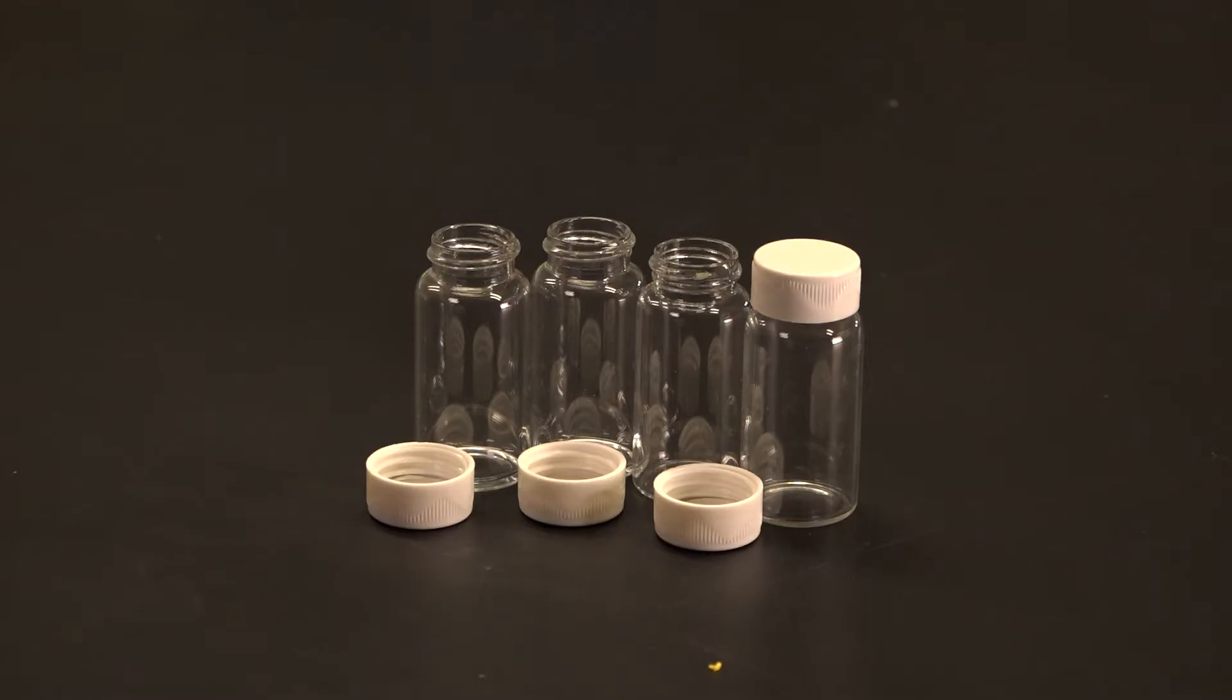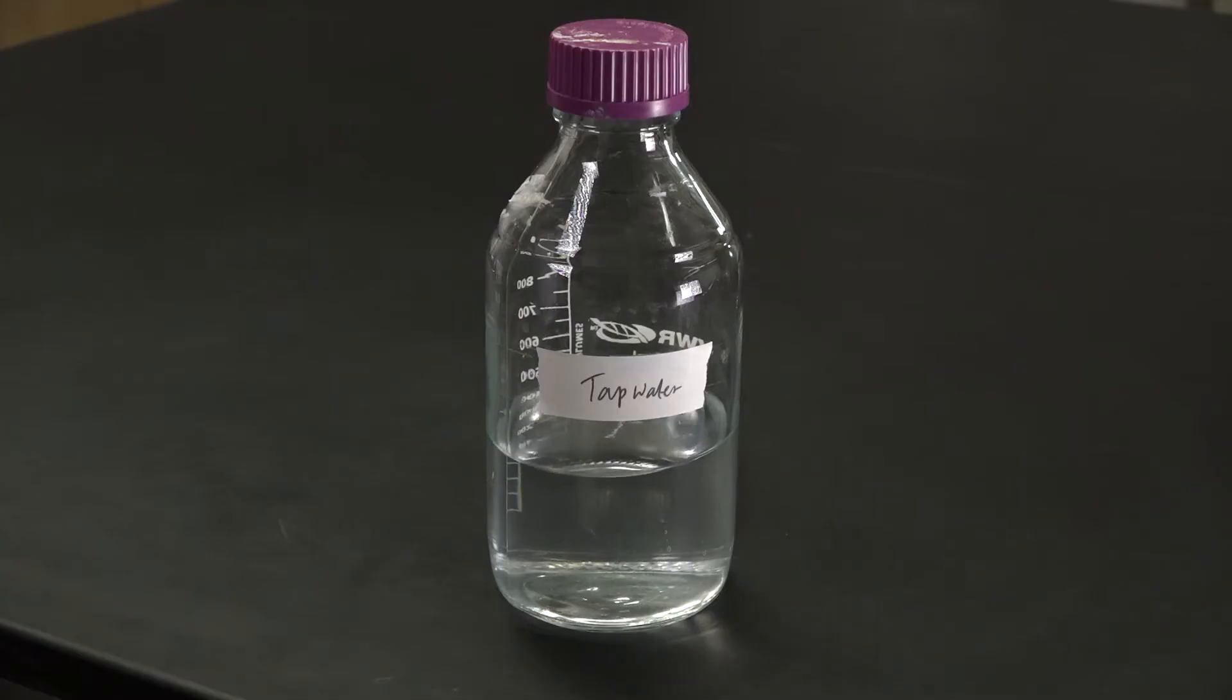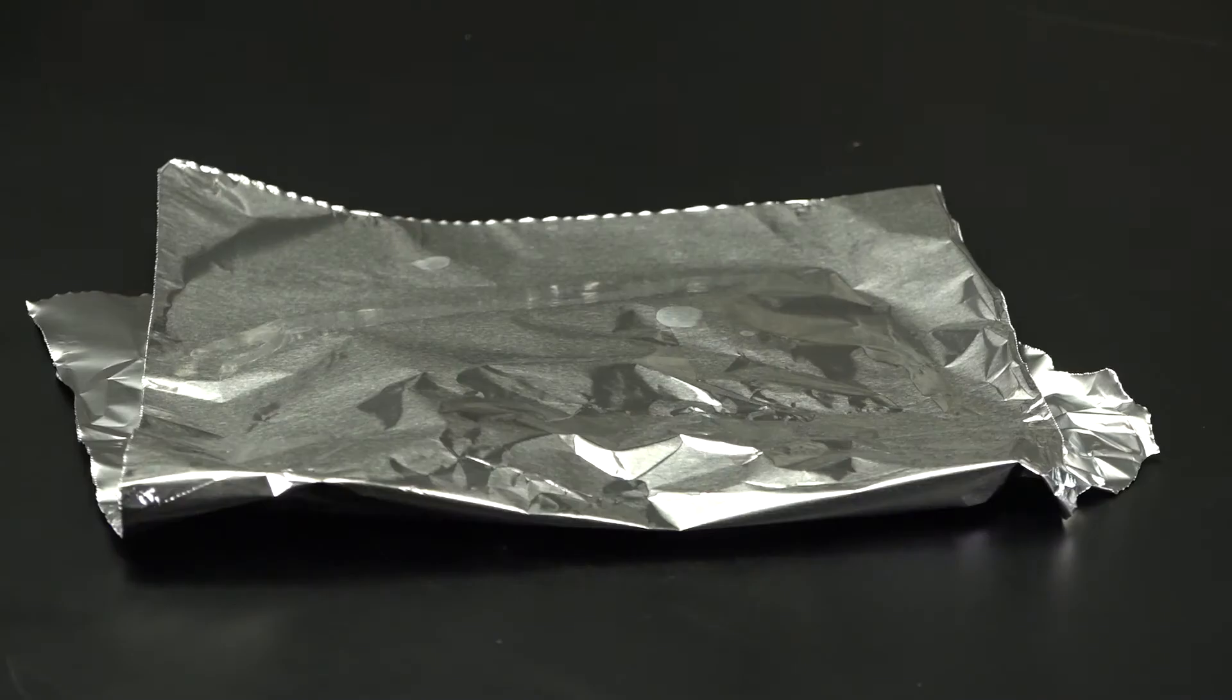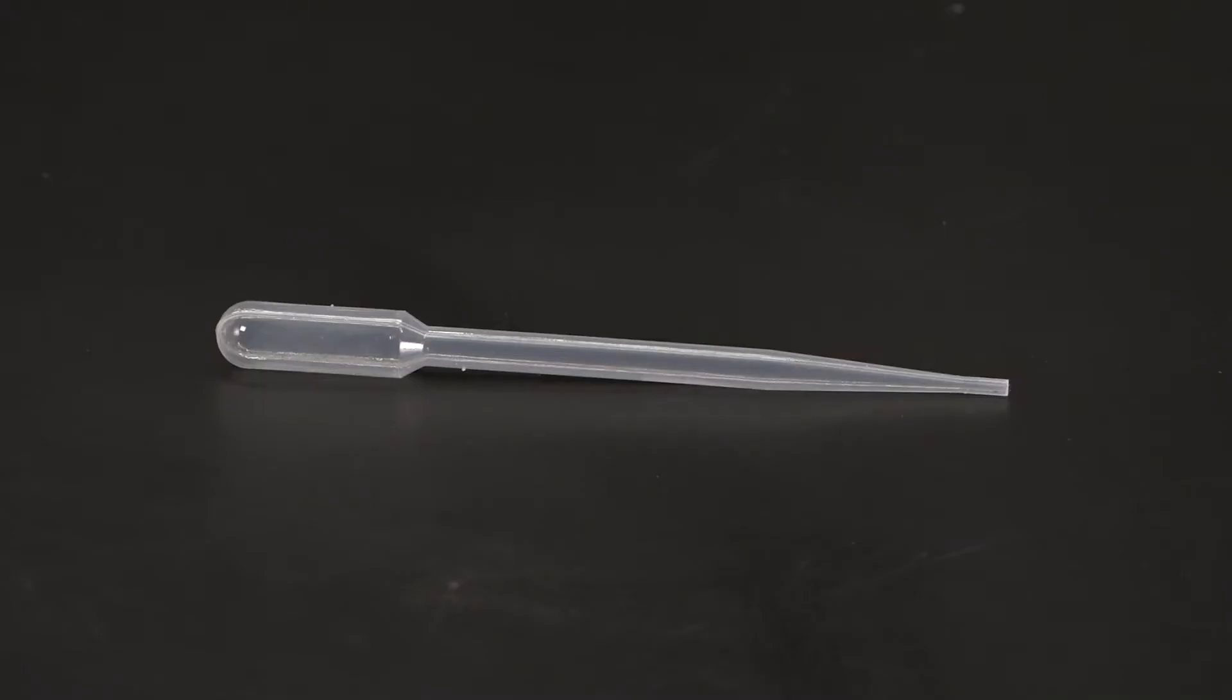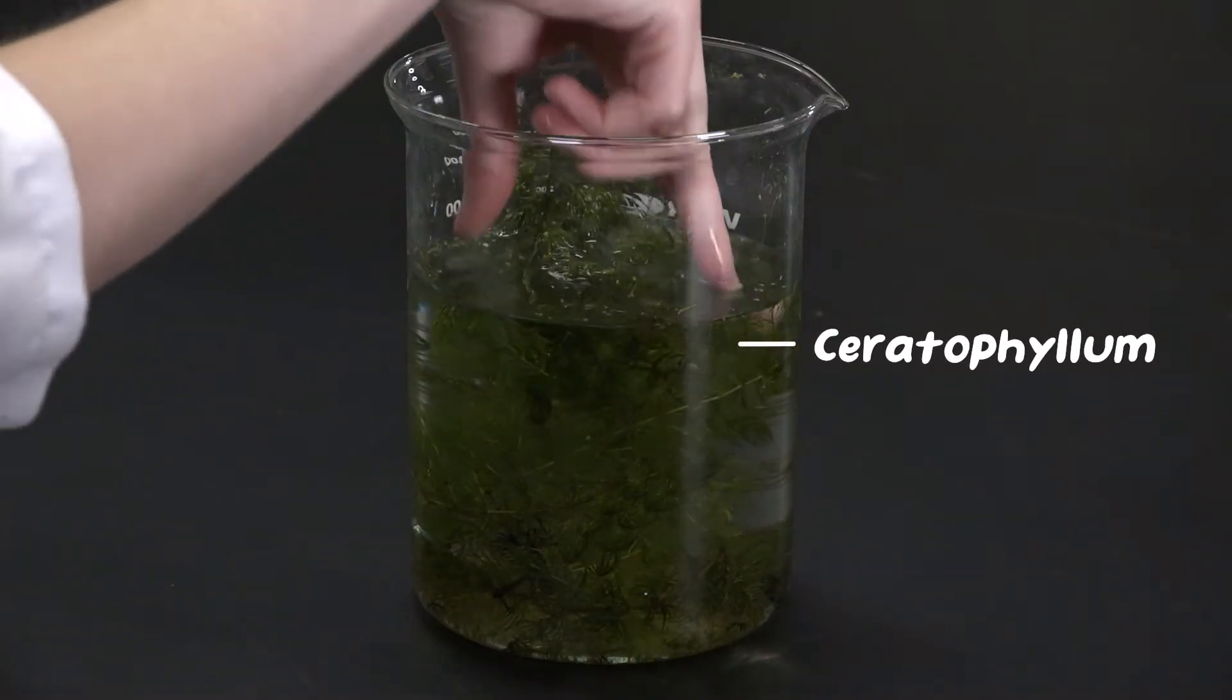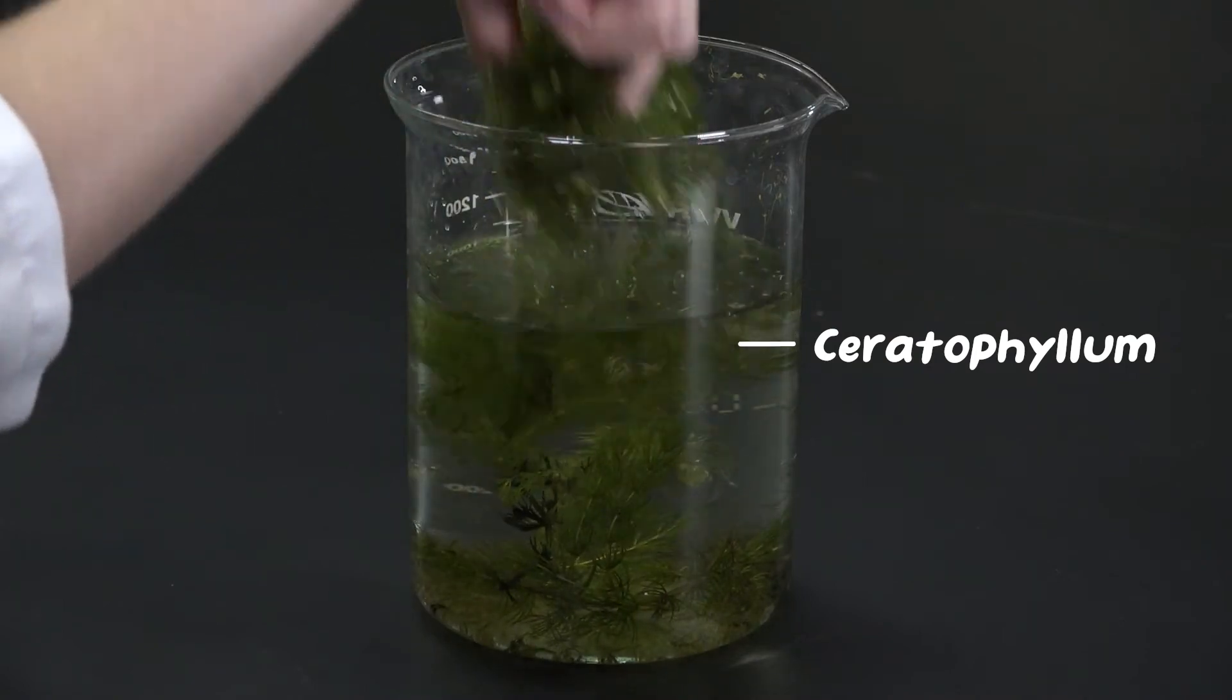Let's set up our very colorful experiment. You'll need four clear vials with tightly fitting lids, tap water around pH 7, bromothymol blue pH indicator, aluminum foil, a pipette, and a water plant. I'm using ceratophyllum, but any aquatic plant will do. Just make sure you aren't using an invasive species.